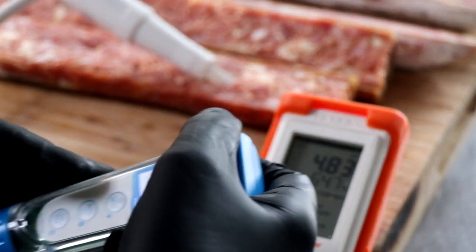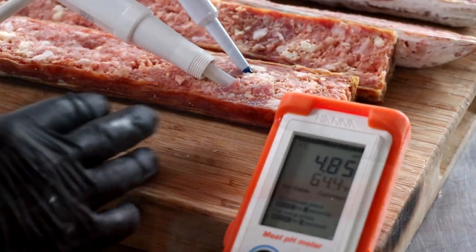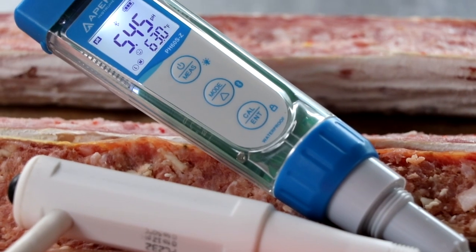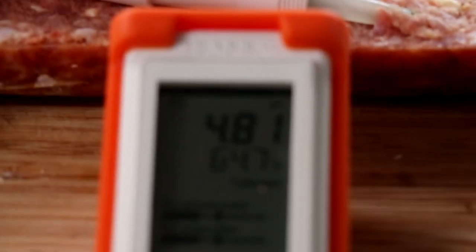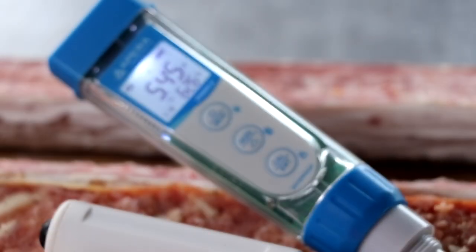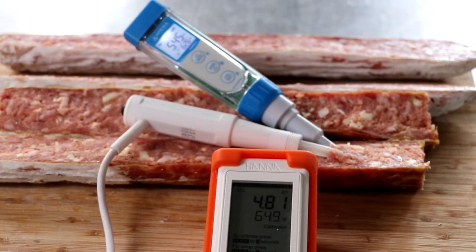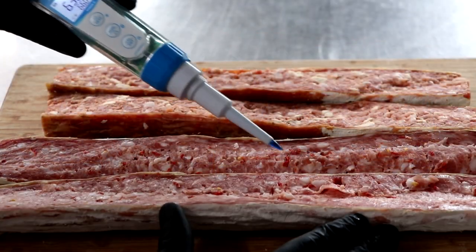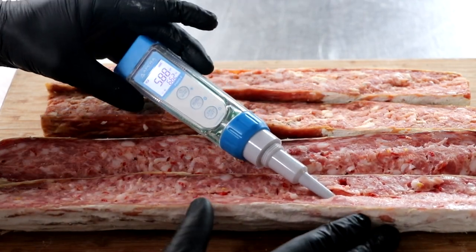Both of these units are calibrated. I'm going to put the Hanna pH meter in first — it's testing at 4.83. And I'm going to put in the Apera Instruments — it's testing at 5.45. Now the Apera Instruments has a slope of 98.9%, so I know that reading is good. That Hanna Instruments reading — I don't know if it's good because I don't have a way to test it, but I can tell you that something's not right and it happened in the fermentation department.